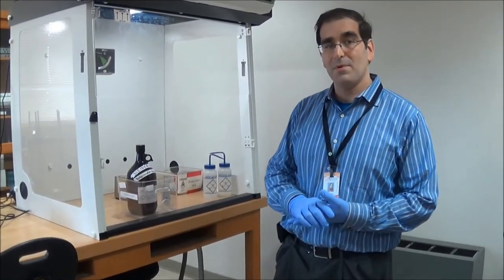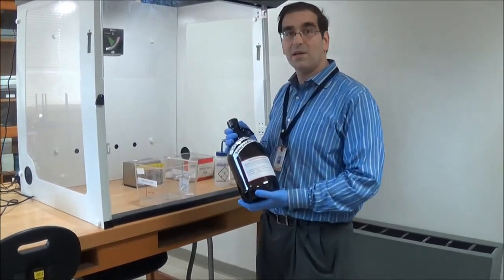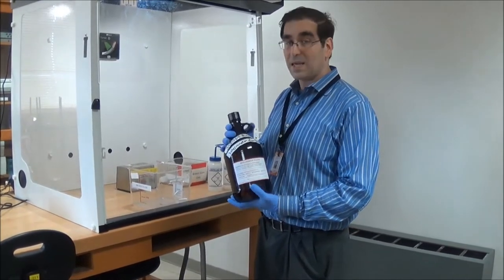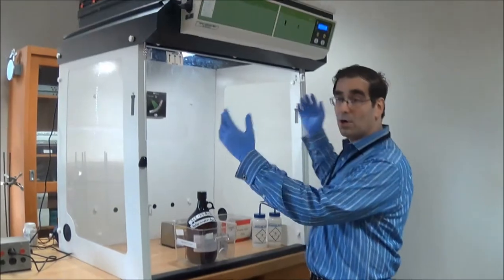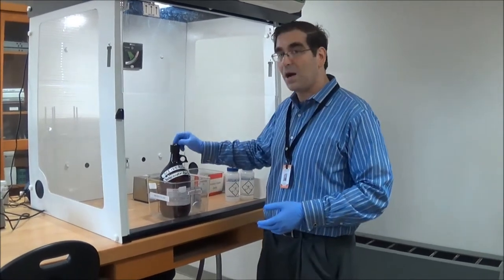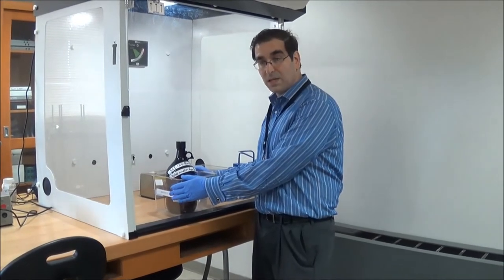The last type of waste container you may find in the lab is the liquid waste container. Liquid waste containers are generally in large 2.5-liter or 4-liter amber bottles, though sometimes they're in smaller bottles, and in Microbiology we have a very large 5-gallon carboy. In general these bottles will be found inside a fume hood — this is our satellite accumulation area — and they will be inside a secondary waste container. The secondary waste container is extremely important: should this bottle ever break, overflow, or spill, the secondary container will catch that, preventing waste from spilling onto the bench or any person.